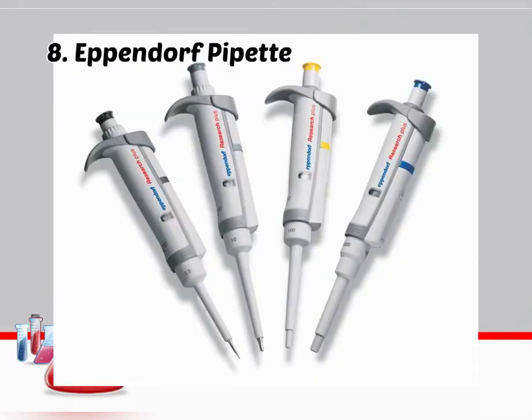Next, we have the Eppendorf pipette. Eppendorf pipettes are commonly a laboratory tool used to measure and transport liquid. Due to the cost of these useful instruments, you'll have to take care to preserve their condition. Pipettes also have different colored tips which represent different dosages.